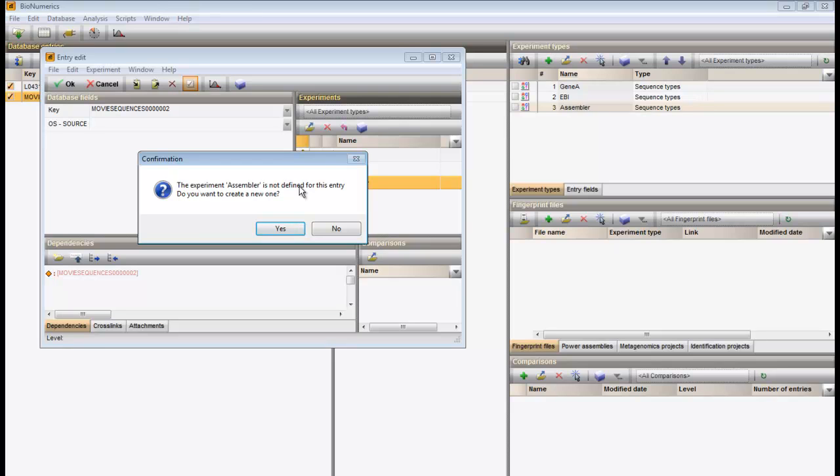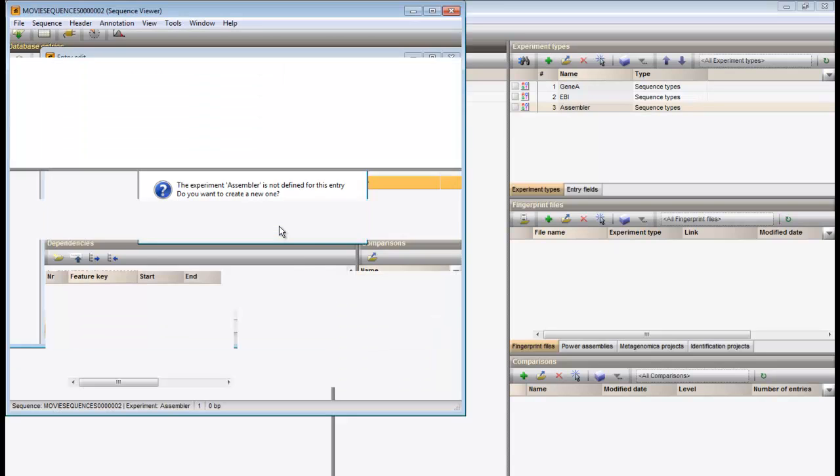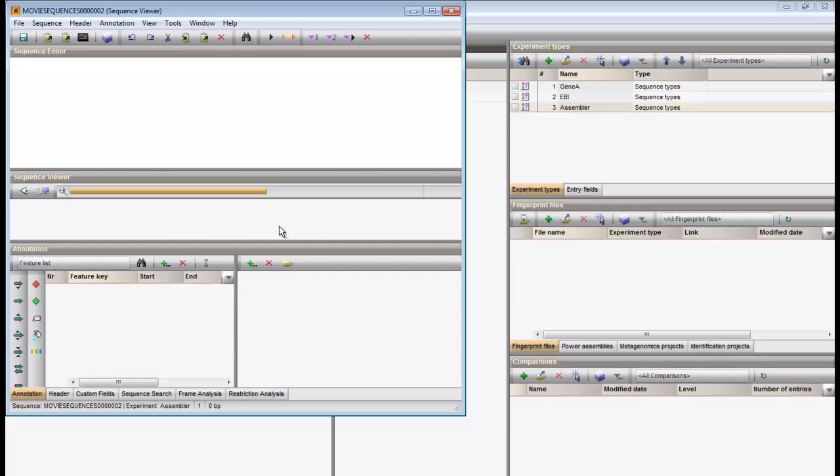The software tells me that this experiment is not yet defined for this entry and asks whether I want to create a new one. I confirm. An empty sequence viewer window opens. We can start assembler by clicking on the Open Assembler button.